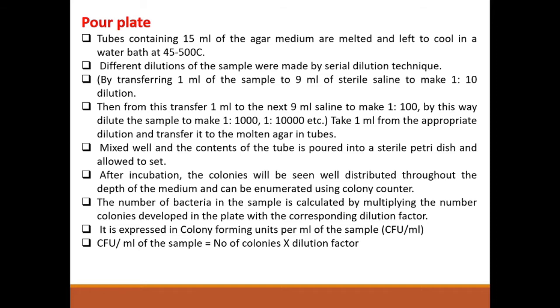Otherwise, if the temperature falls below 45 degrees Celsius, it will become solid. So we cannot pour the content from the tube into the petri dish. So first we have to prepare that.